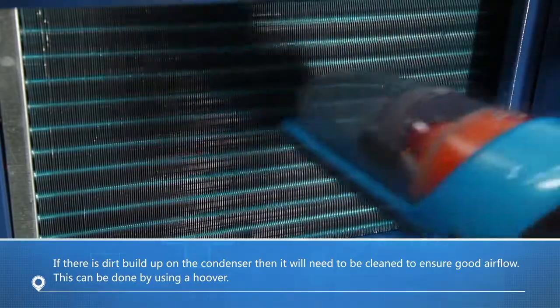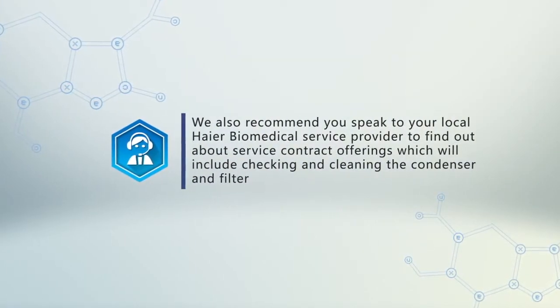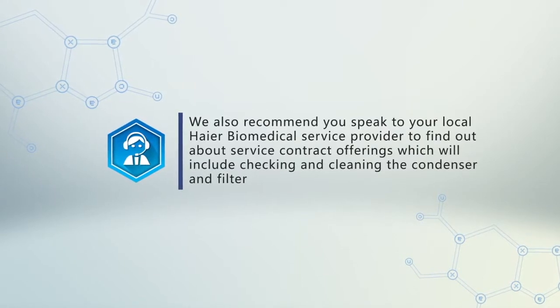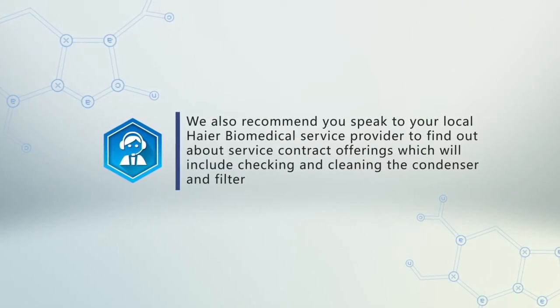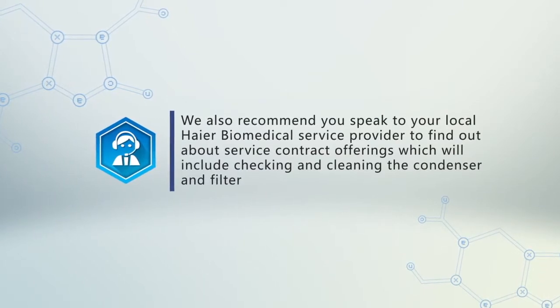This can be done by using a hoover. We also recommend you speak to your local Haier Biomedical service provider to find out about service contract offerings, which will include checking and cleaning the condenser and filter.